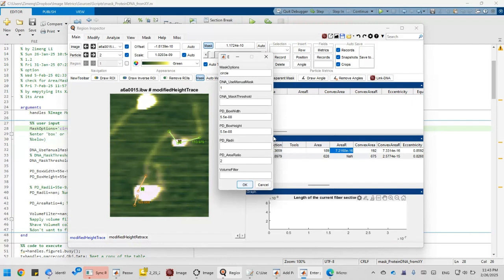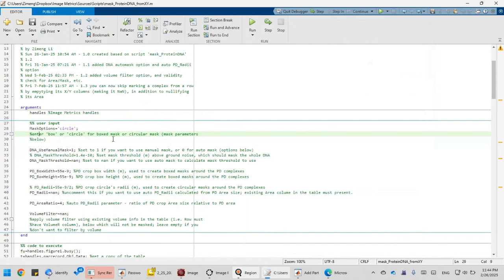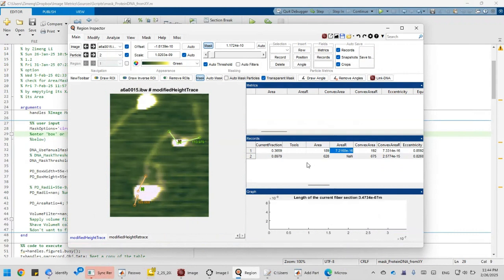Now you have to do this every single time, and I'm not preferring this, because we don't actually change these parameters much, if at all, for a particular data set. It usually remains the same. So I usually just set my parameters in this profile and then click the non-interactive version of my profile.